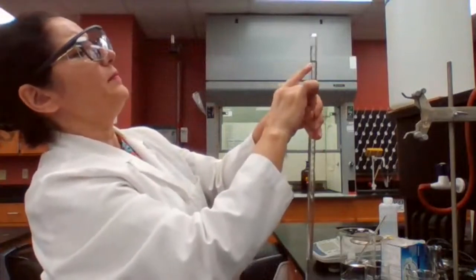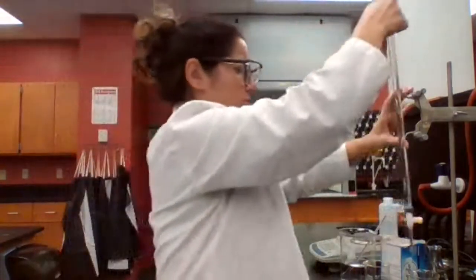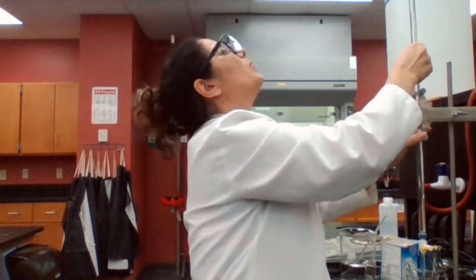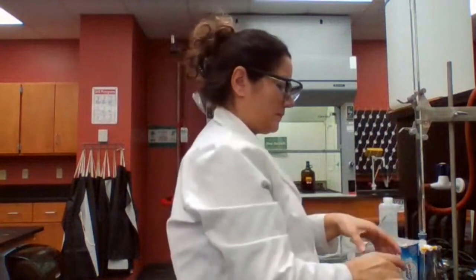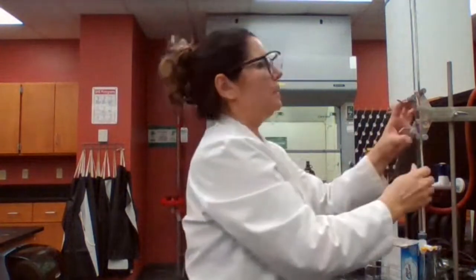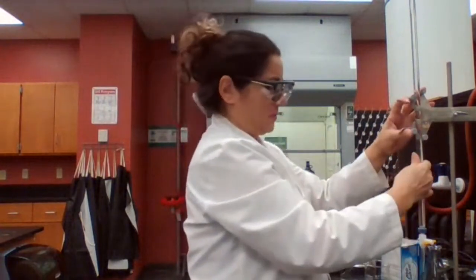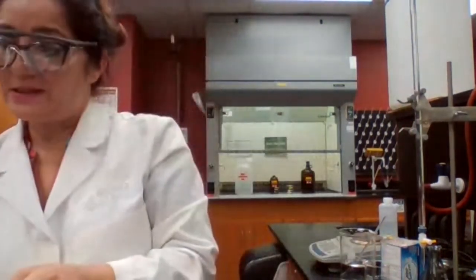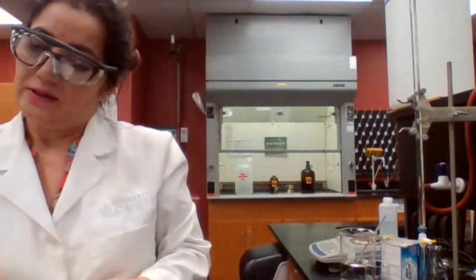So my starting volume is going to be 1.00. Initial burette reading for me is going to be 1.00. At this point, I have to dispense some more liquid to get rid of any air bubbles that we have. So next we have the initial burette reading: I have 1.00 initial burette reading.